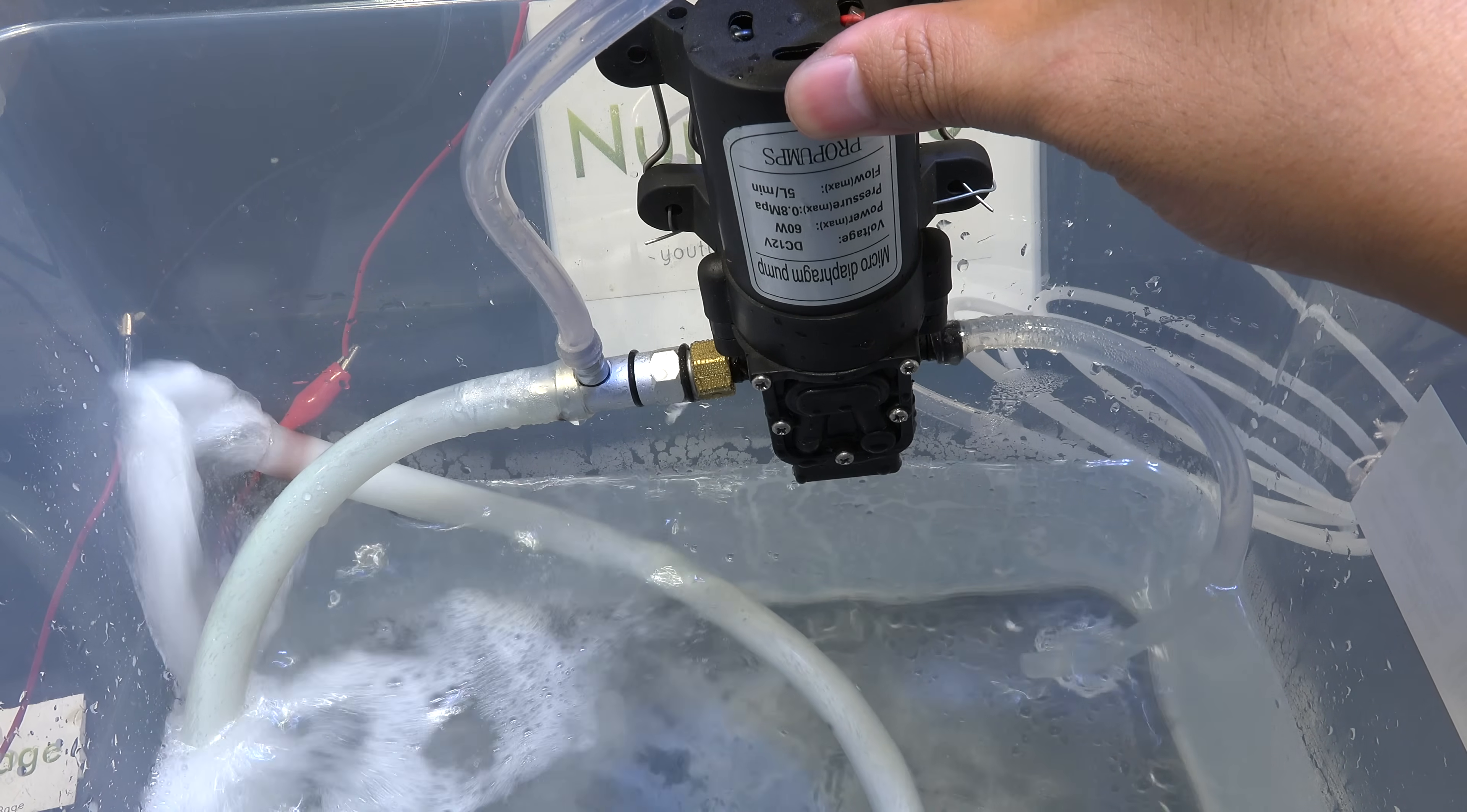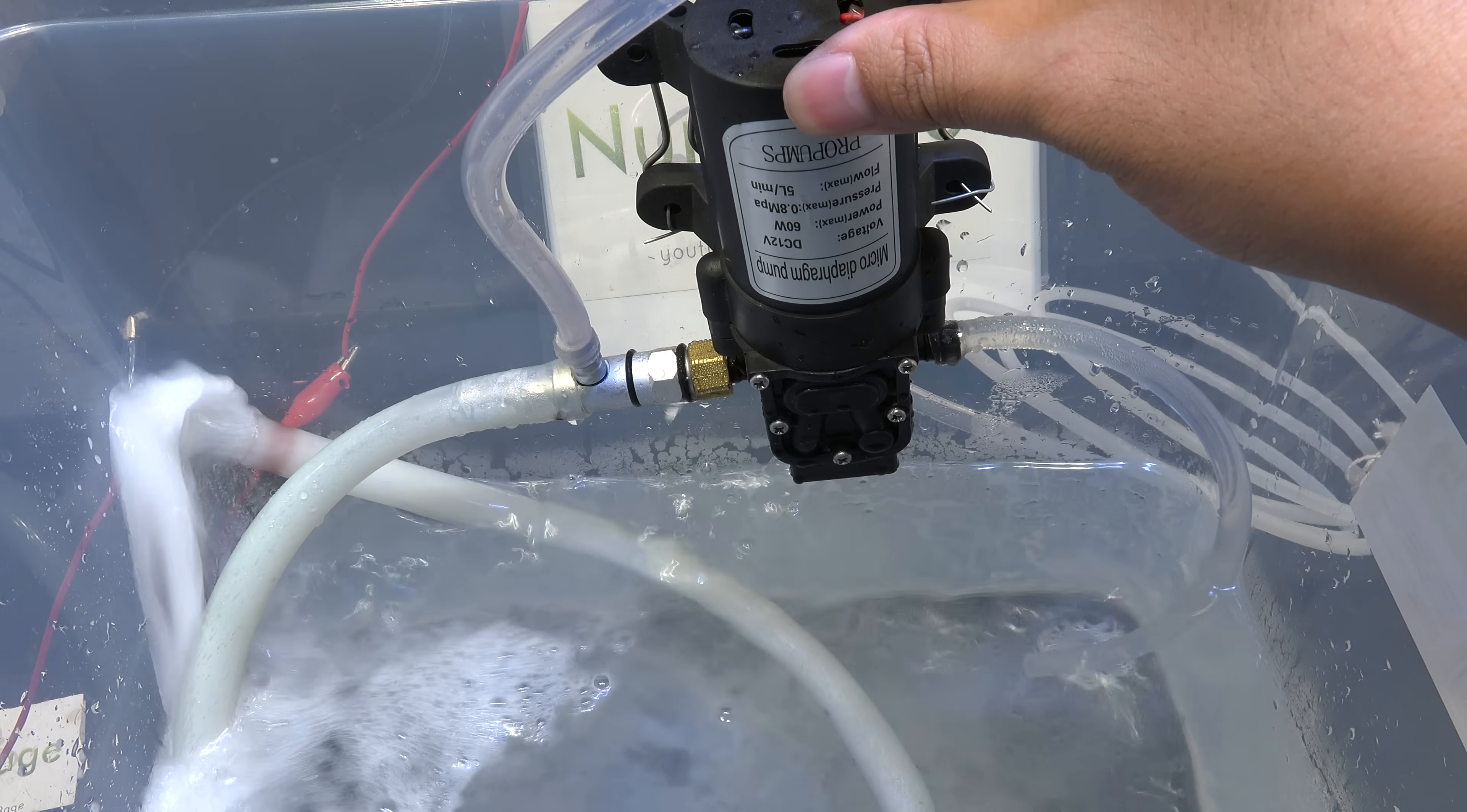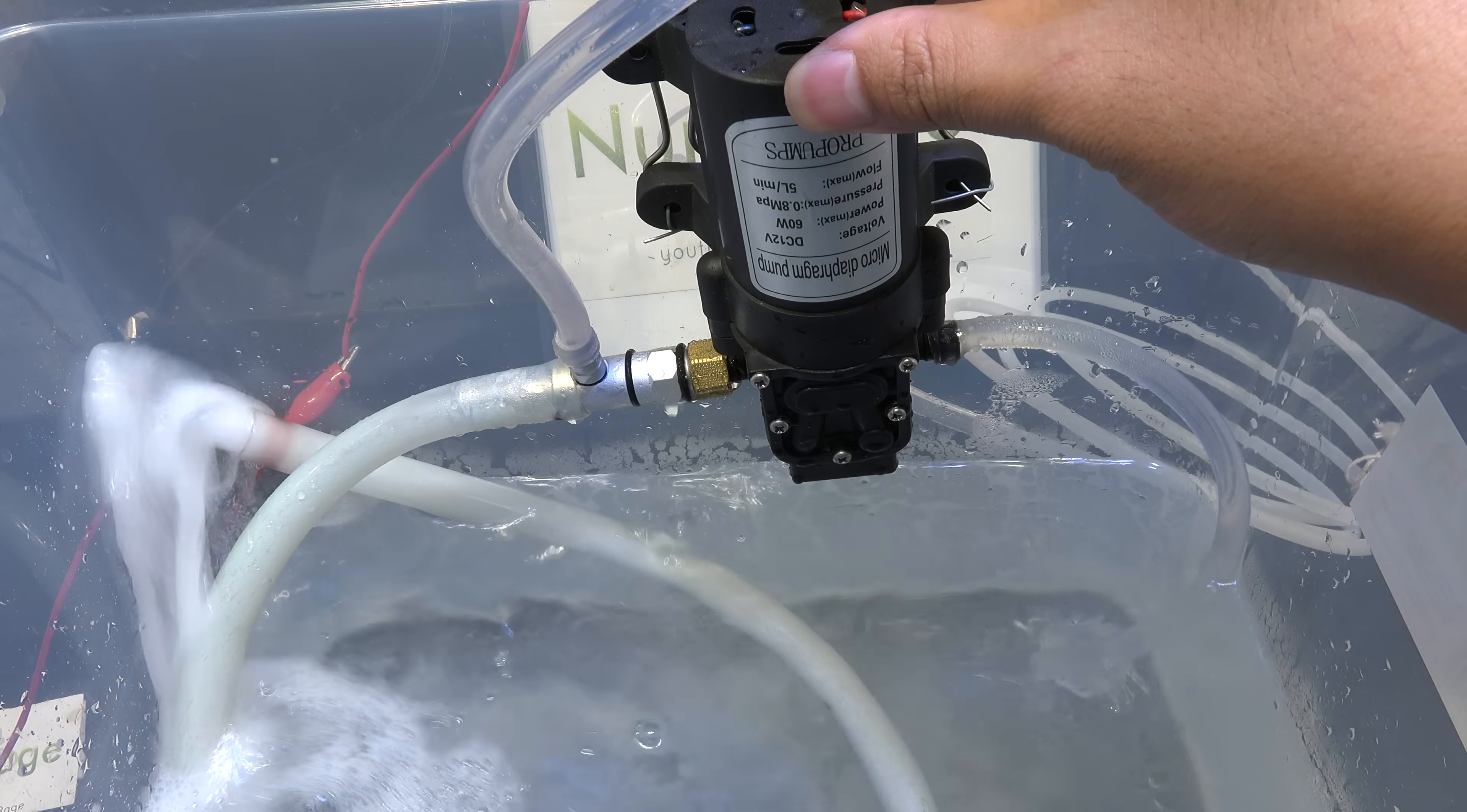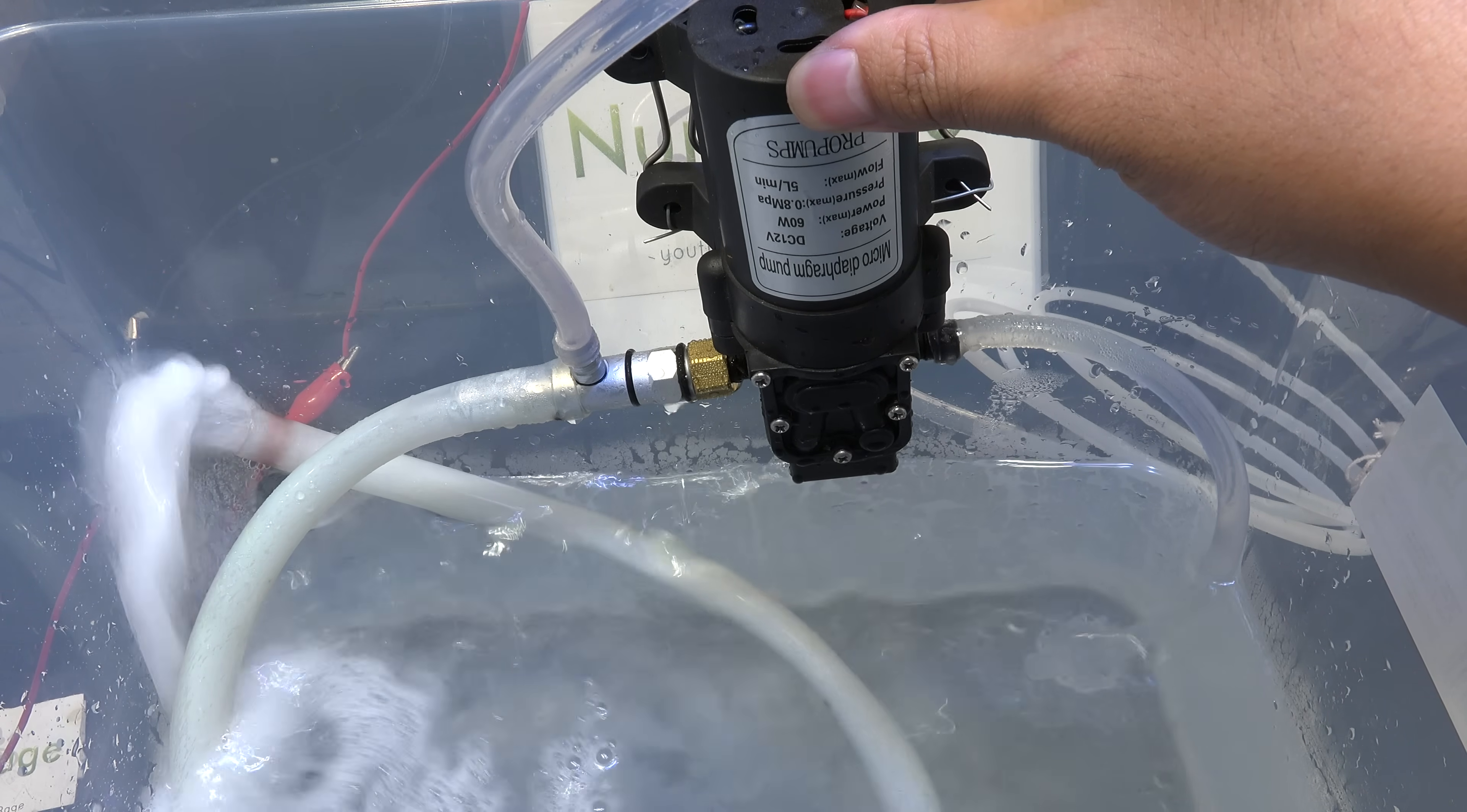The great thing about this is that whatever gases are sucked in by vacuum are in turn very well scrubbed by the water. So if you have any reactive gases you can efficiently remove them from the stream if you add appropriate neutralizing chemicals to the water. I like to use some hydroxide for scrubbing most of the gases I encounter. We effectively created both a chemically resistant vacuum pump and a gas scrubber in one.